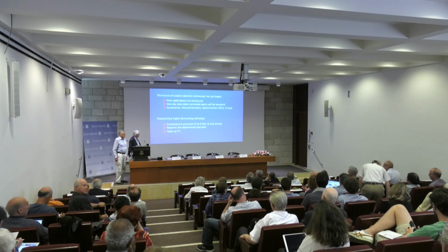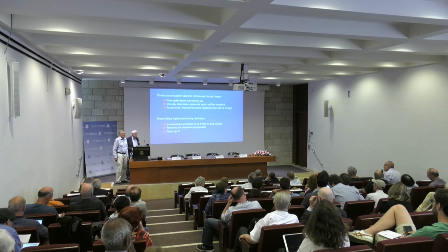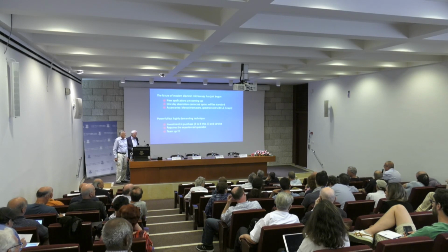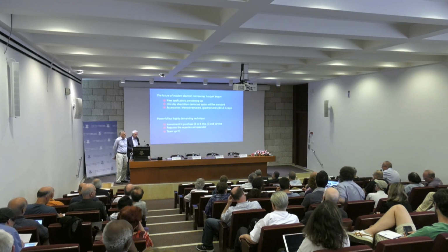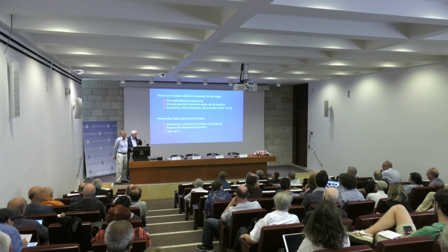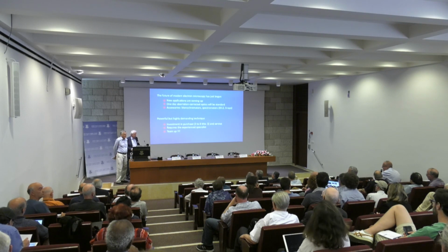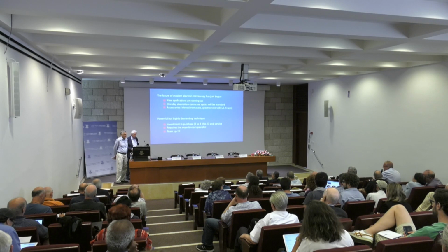Thank you, Knut, for this wonderful talk and for the wonderful invention of the aberration-corrected microscope. So now we have one here in Jerusalem at the Nano Center as well. And what I'd like to ask: you showed us the challenge of nanoparticle imaging. Now, many nanoparticles have an organic-inorganic system where they are coated by organic monolayers. So part A of my question is how to handle degradation by the beam and beam-sample interactions in general. And second, is there a hope to image those monolayers, perhaps?